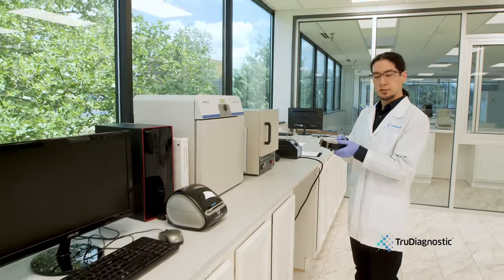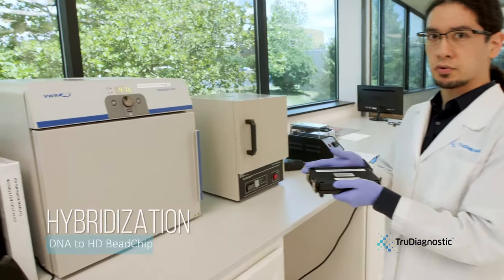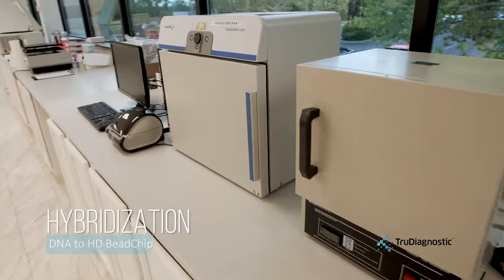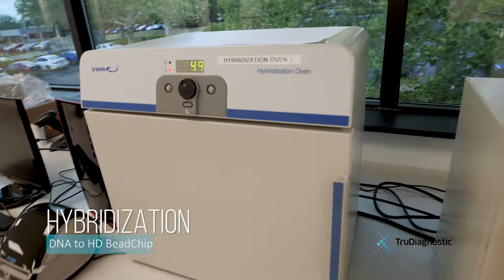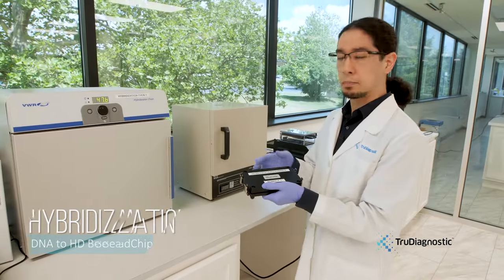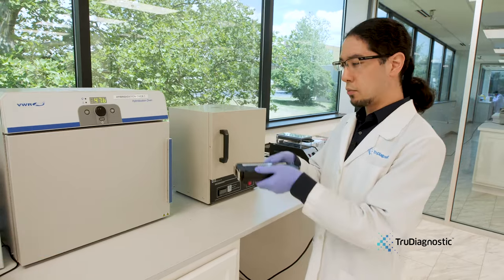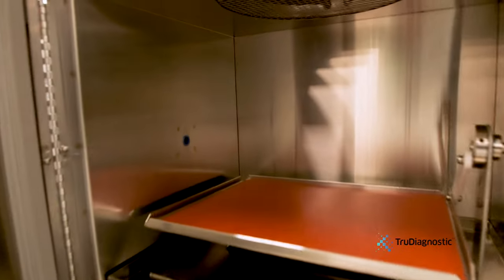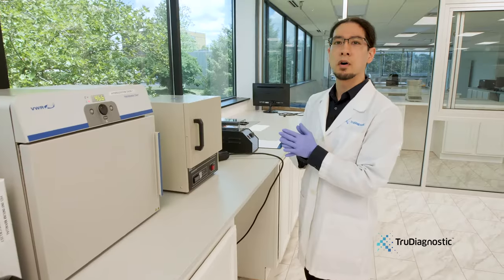After the pre-amplification room, the samples are transferred to the post-amplification room where the DNA samples will be amplified, fragmented, and hybridized onto the HD Illumina bead chips. These bead chips have eight wells that contain pre-probed oligos that will bind to the target DNA, which is then put into the hybridization chamber for the DNA to completely hybridize to the oligos themselves.